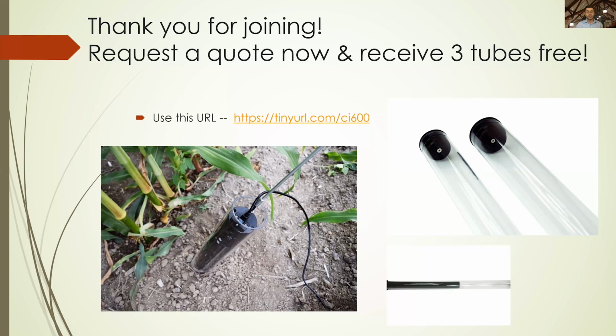So the image size taken in one scan, actually, that's a multi-part question, to be honest. It is measured by just the scanner head of the device itself. So as I already mentioned, it is actually just 34.3 centimeters by 6.35 centimeters of a scanner head on the 600. But when you stitch all those images together, you can get a far bigger picture. As well, when you're changing the DPI, that size of image is going to be the same, but of course you're changing the resolution and the pixel count. So you can get a lot larger data files if you go to a higher resolution.